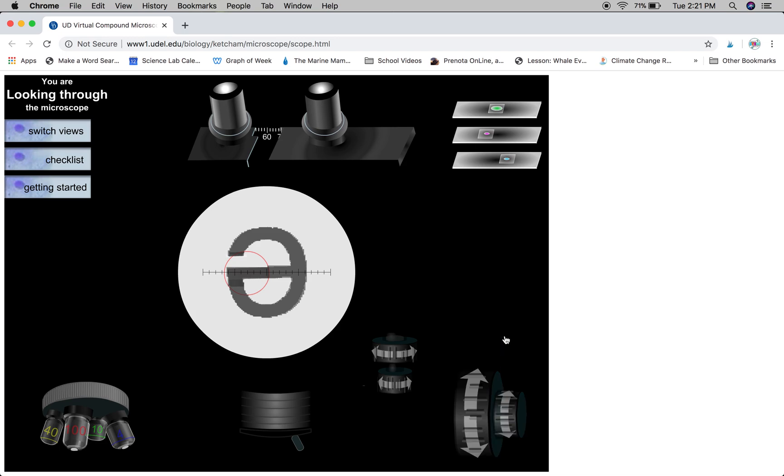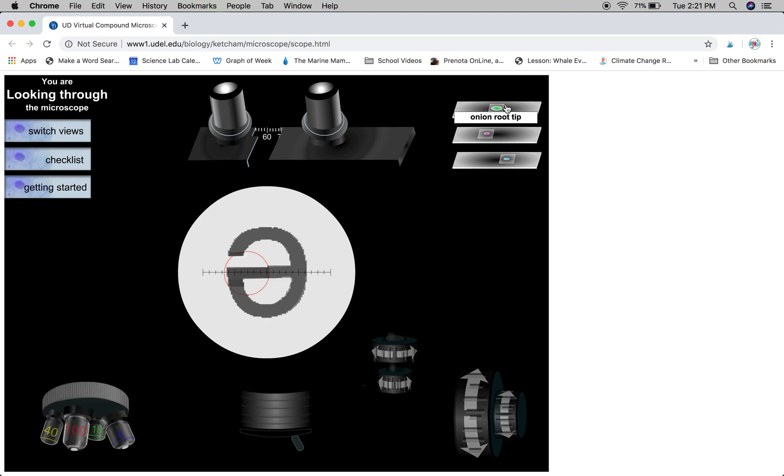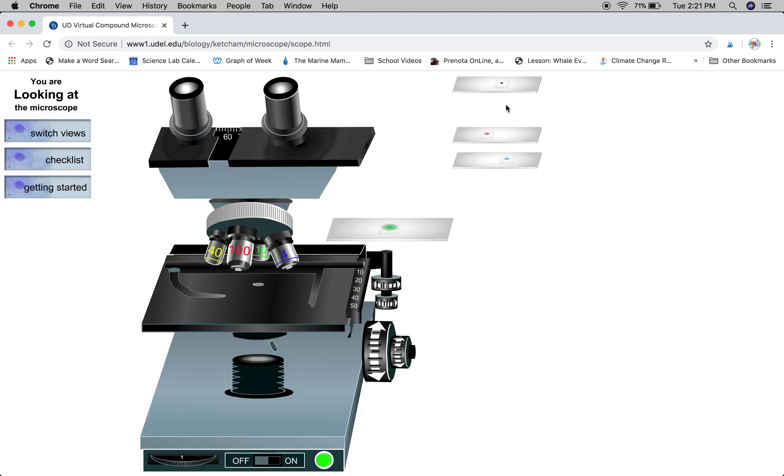At this point, you can continue viewing in higher power magnification or you can go ahead and view your next slide following the same procedure.